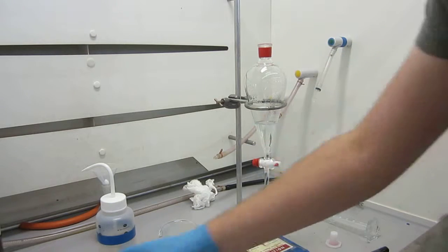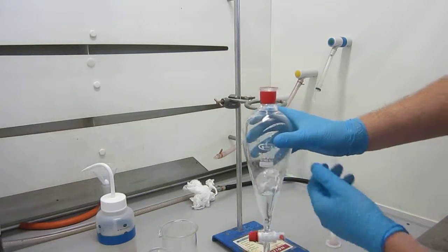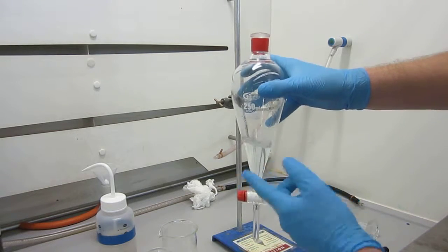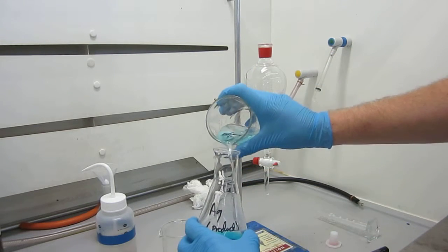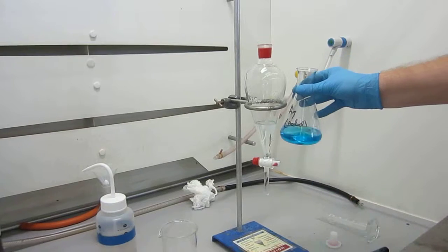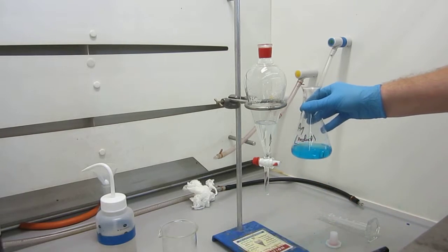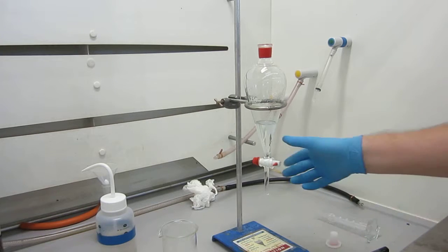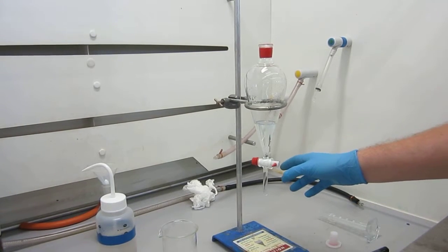So now you can see we've got our 2 aqueous product layers and our organic reaction mix layer, where we've got a very tiny amount of blue coloration left in our organic layer, so taking mostly all of the product out, and then very blue product aqueous layers, which I'm going to combine because I'm happy that they're the same, to one blue product layer. Extracted all our product from the reaction mixture into an aqueous, water solvent, ready to work with next. And our ethyl acetate should hopefully just have impurities left in it. At this point, yeah, that'll do.